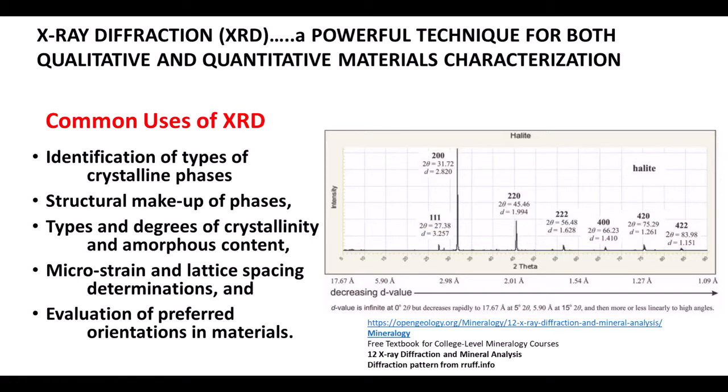X-ray diffraction, often referred to simply as XRD, is a powerful technique for both quantitative and qualitative analysis and characterization of materials. Actually, X-ray diffraction has been used for more than a century, and its uses continue to grow. Common uses of XRD are to identify the types of crystal phases present, the structural makeup of the phases, the types and degrees of crystallinity or amorphous content in a material, and phase fractions.